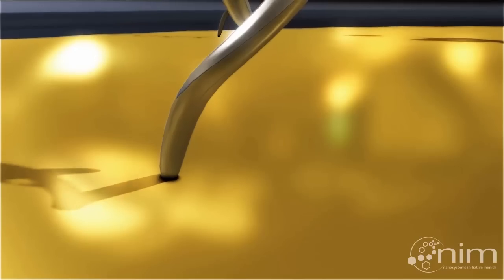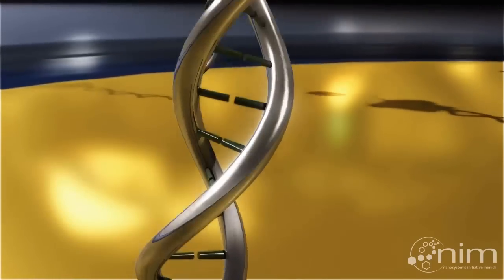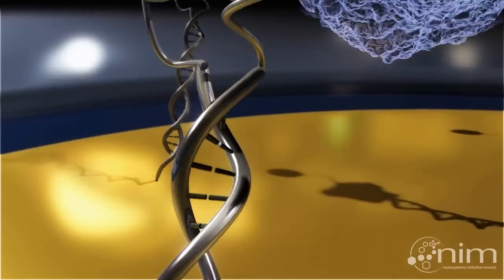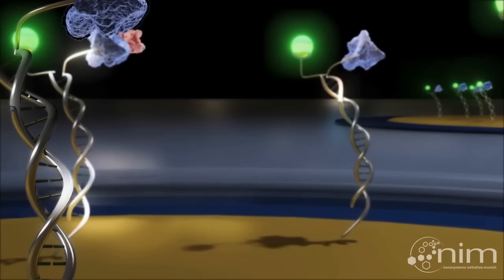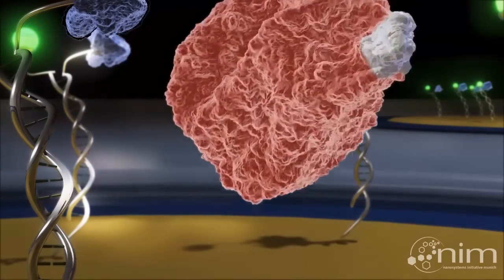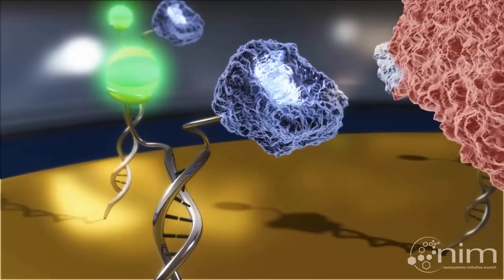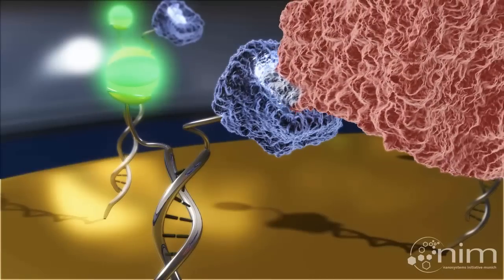The other strand of the DNA helix can be functionalized with any desirable capture molecule, here shown in blue. As the red target is captured by the DNA probe, it alters its hydrodynamic friction, slowing down the DNA movement.